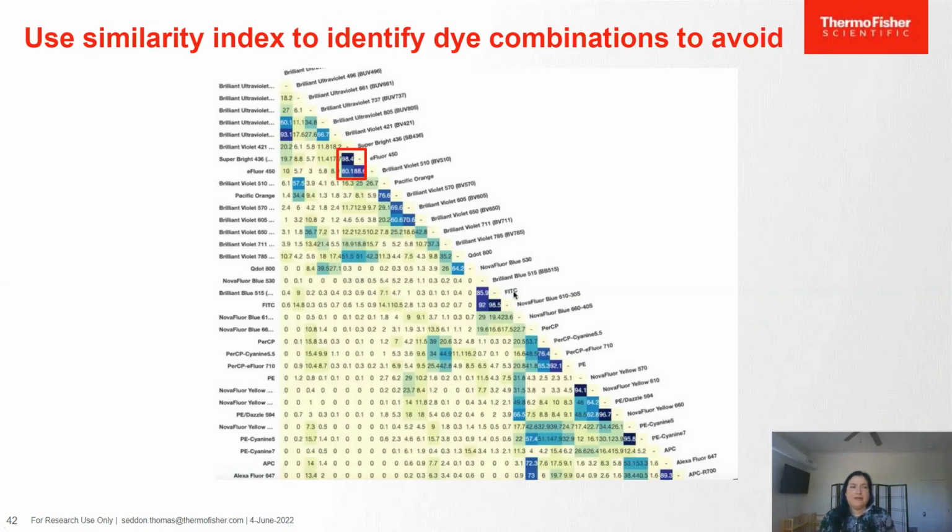And interestingly, when you're building out the panel, you can look in the panel builder at the complexity score. One of the things I noticed as I was building this was that the complexity score didn't necessarily go up when I added these in a very small panel. When I talked to a mathematician about this, they said that the earlier number was already telling you that you had made the worst decision possible.